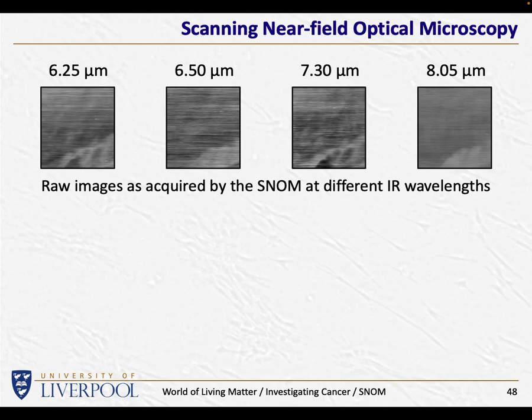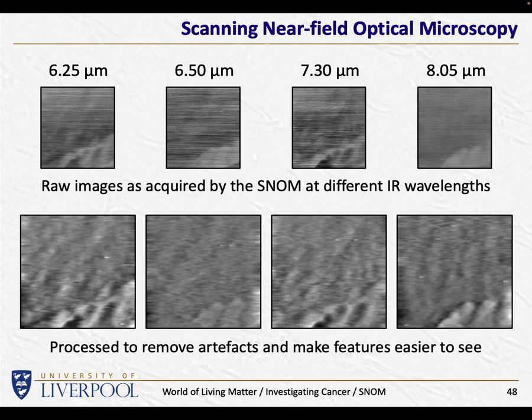They are relatively high resolution in the sense that they're higher resolution than we could possibly see with an optical microscope. These scales are, for instance, tens of microns or so. And remember, with an optical microscope, we can't see anything much smaller than a micron. But we were interested in probing with this particular scanning microscope system to see if we can see any details smaller than could be visible in optical microscopes. We tried a little bit of image processing, we tried a little bit of tidy up, and although it's difficult to see what we were looking at, we were encouraged by the fact that whatever it is we're looking at, it looks different at different wavelengths.